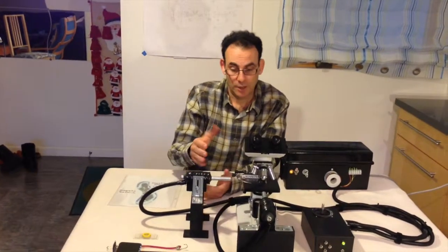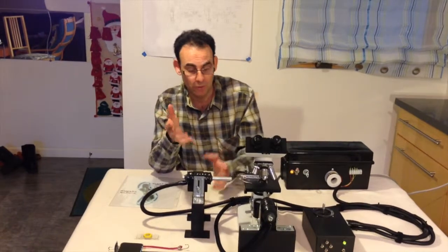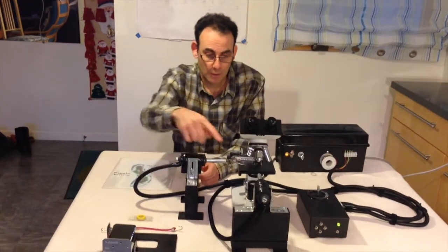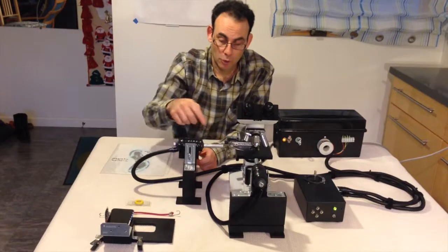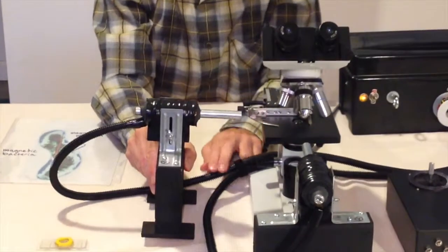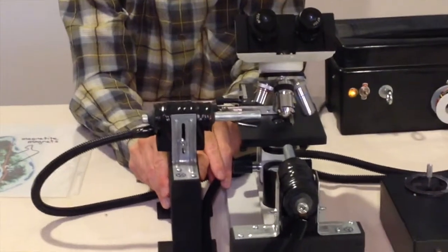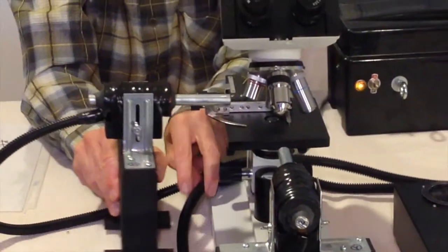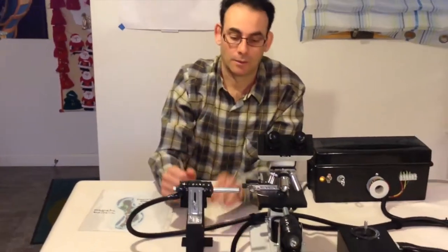Our two electromagnets produce our magnetic field components in the x and y directions. The way we've shown it here, they're pulled back so that you can see them. When we actually use them, these soft iron cores are designed so that they can come in and get right up next to the sample that contains the bacteria.